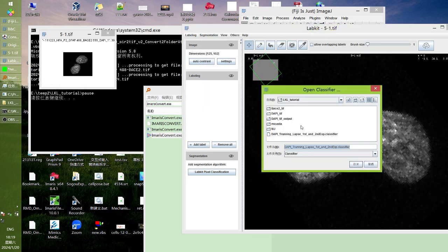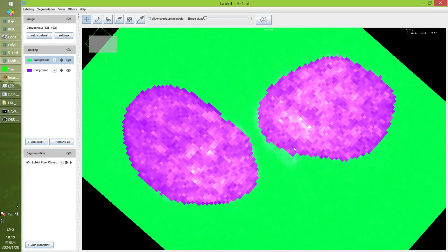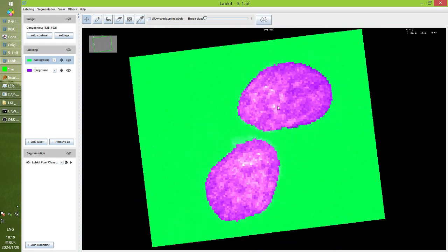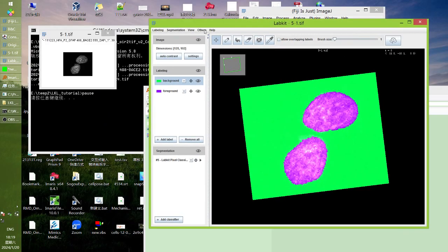After you open it, immediately load it and immediately process this image. Because it is small, it is very fast. And now the computer is idle, so it is not busy. Now we can start to do the batch processing. This image is useless, we are not going to use it. It's just to activate the environment.